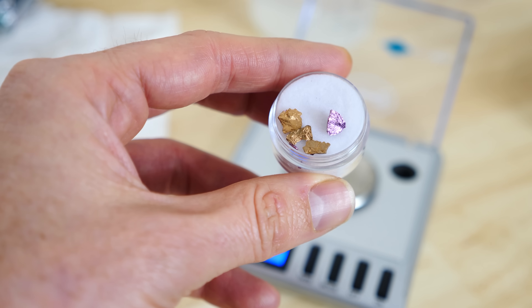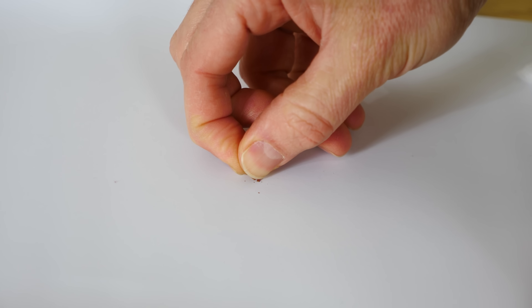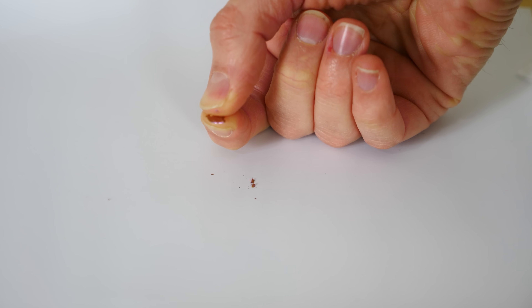Let's break one of them and see what the layers underneath look like. It's still pretty brittle, and inside you can see that it's actually still purple.